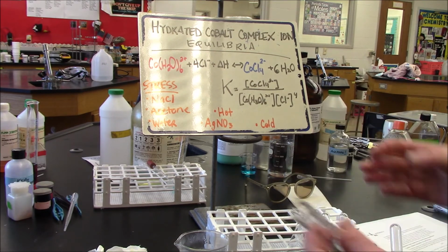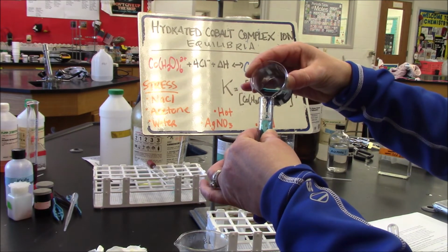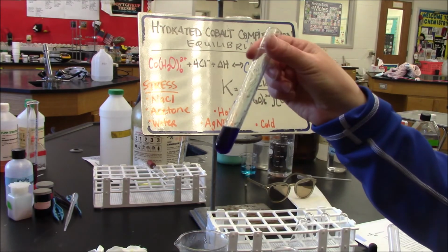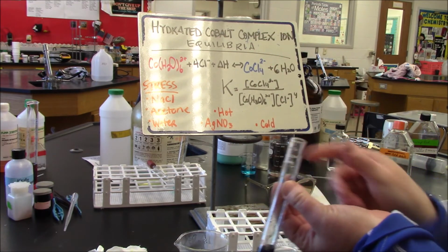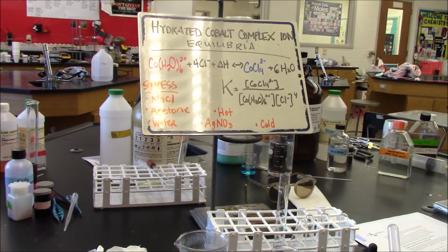So, I don't know. Let's see what we can do here. To start, I'll go ahead and I will add sodium chloride.